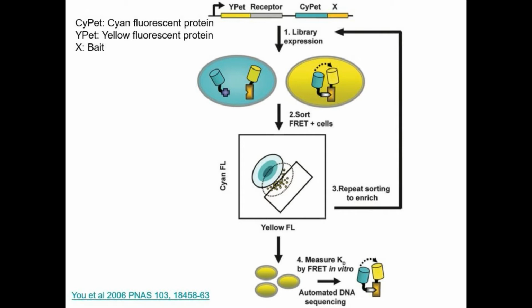And FRET is going to see whether we can transfer the resonance energy from one bait protein to the prey protein in such a way that your absorption spectra and emission spectra can overlap and help to visualize secondary effects after you have given certain input.